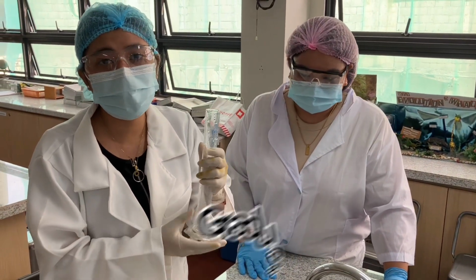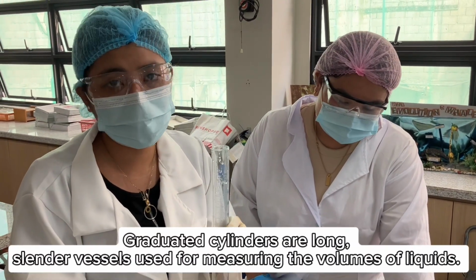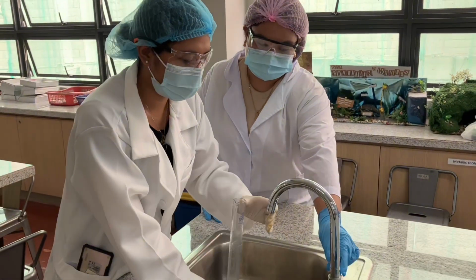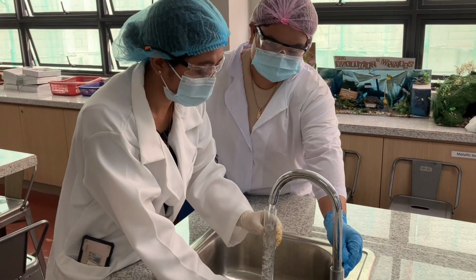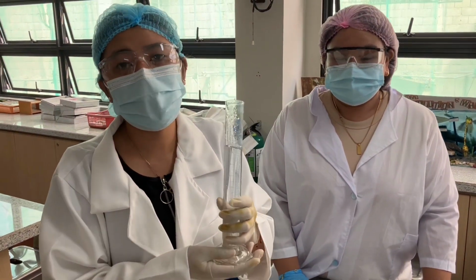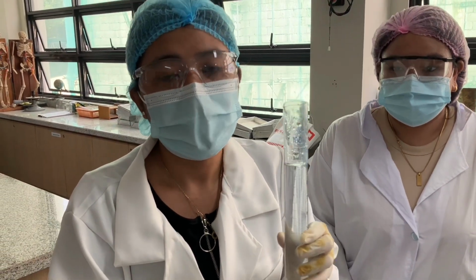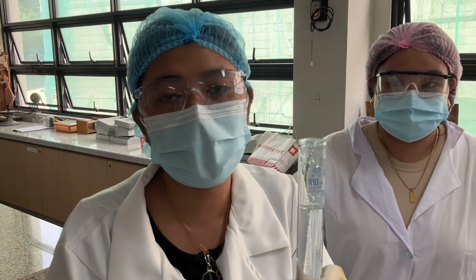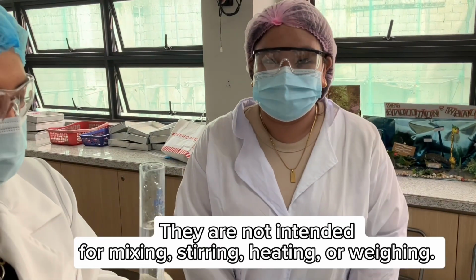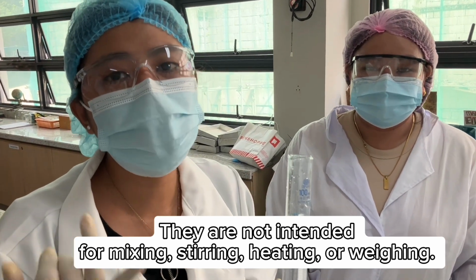This is a graduated cylinder. These are used for measuring volumes of liquids. And theoretically, dito manggagaling yung mixture natin. Remember na hindi sa lahat ng mixture ay pinupuno siya, especially kapag acidic or explosive yung liquid na i-measure natin. And the cylinders are not intended for mixing, stirring, and heating.